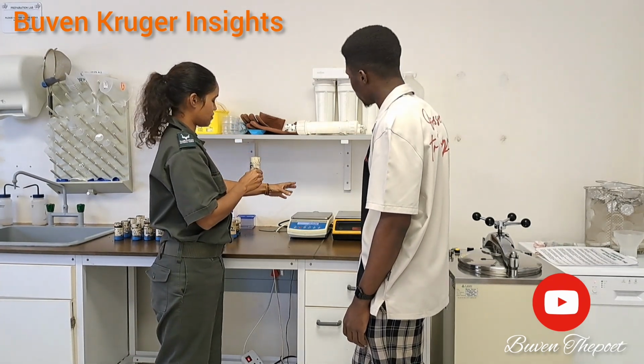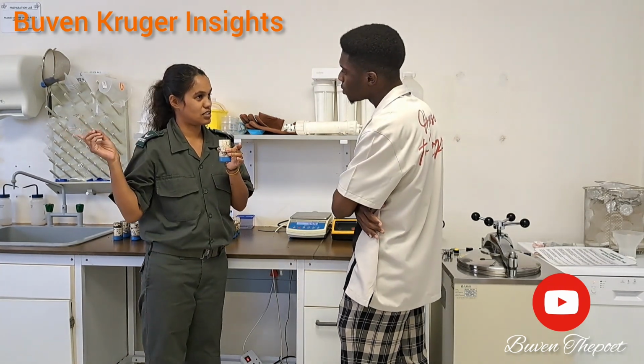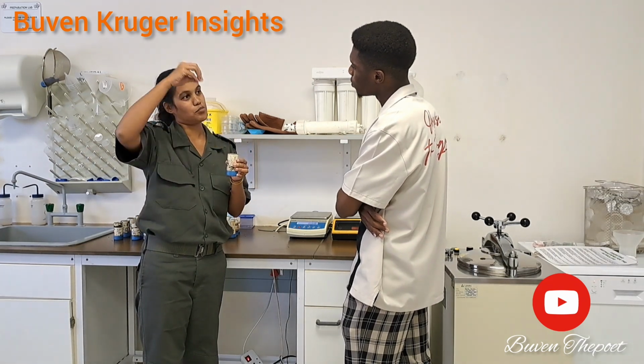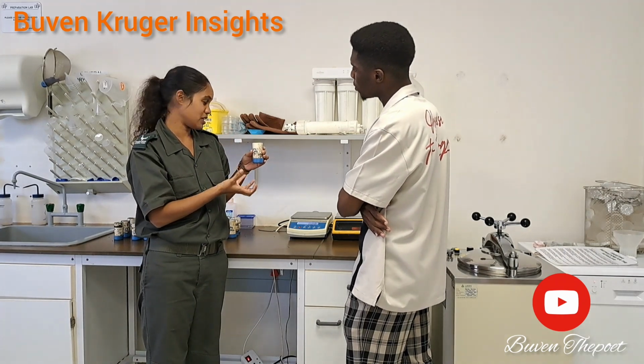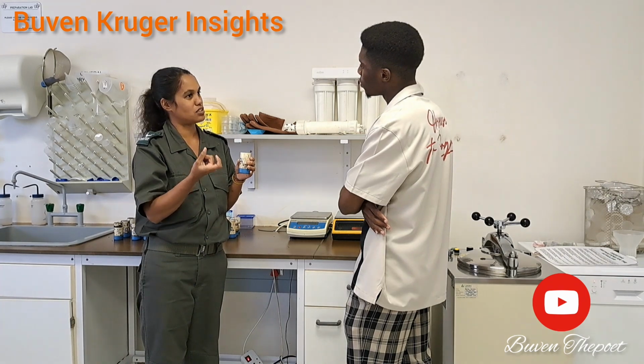And then after we have that, what we consider wet weight, we put this in a drying oven at 105 degrees for 24 hours, and over that time the water evaporates. So when I measure it again, it has less weight and it's lighter because the water has disappeared. And that's how we can calculate how much water is in the soil.